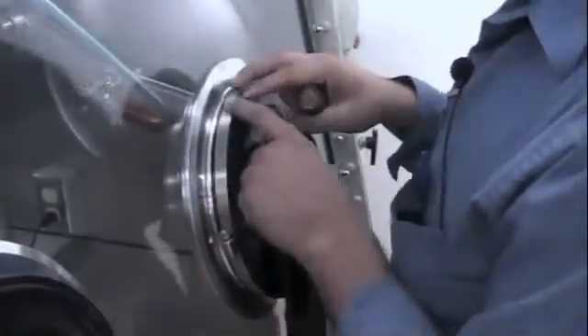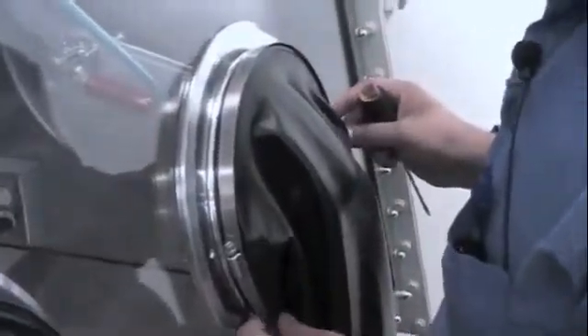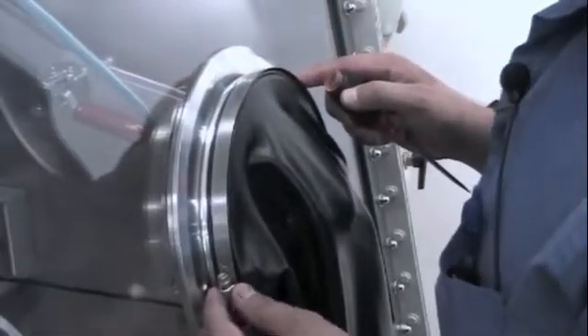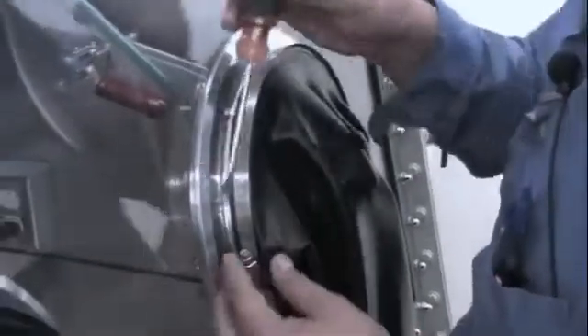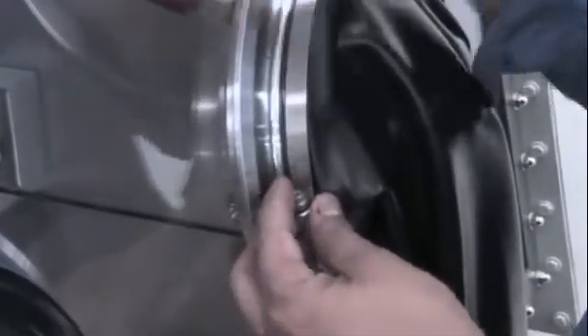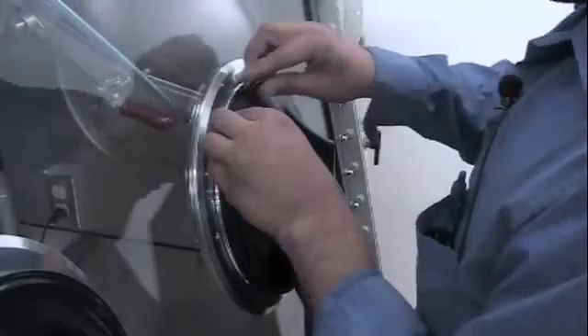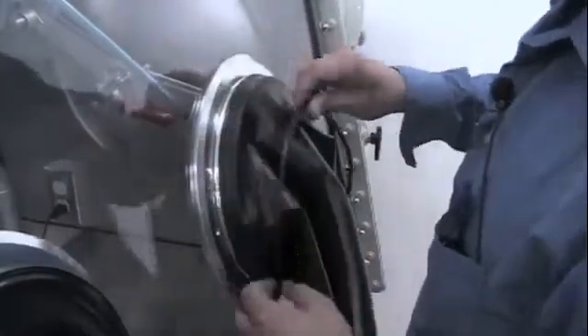We then proceed by removing the glove port clamp, and we can do this with either a 5/16 inch socket or a flathead screwdriver. We remove the clamp, then remove the electrical tape, and then we remove the glove o-ring.